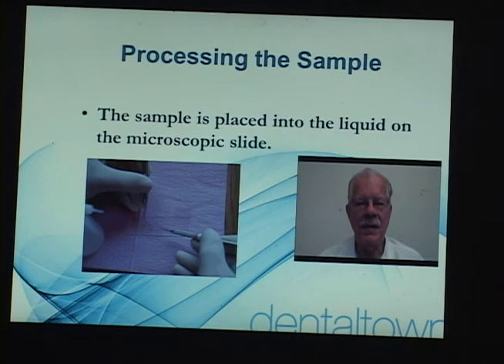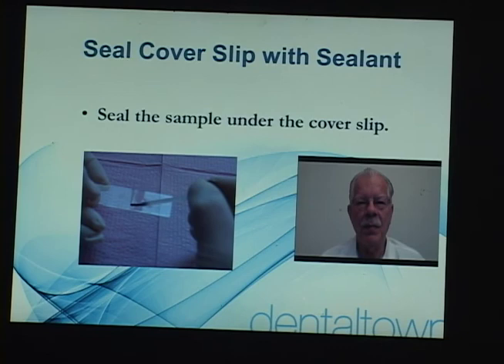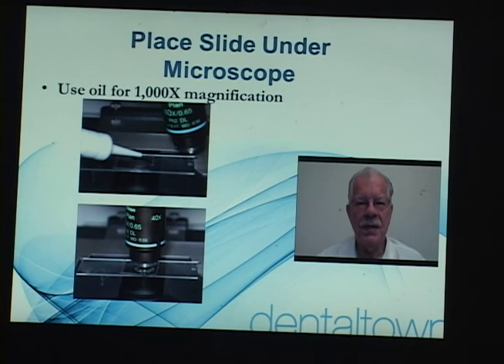Now we're preparing the slide. We put a little solution on there, put the sample in the solution, place the cover slip on it, flip it over onto a piece of towel paper to absorb the excess fluid, and then we seal the slide cover slip onto the slide. We are sealing the slide — it's like nail polish, just take a little bit and seal the edges all the way around the cover slip, and it creates an anaerobic environment for this bacteria.